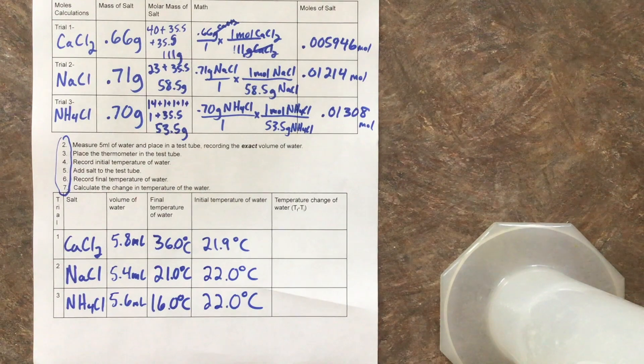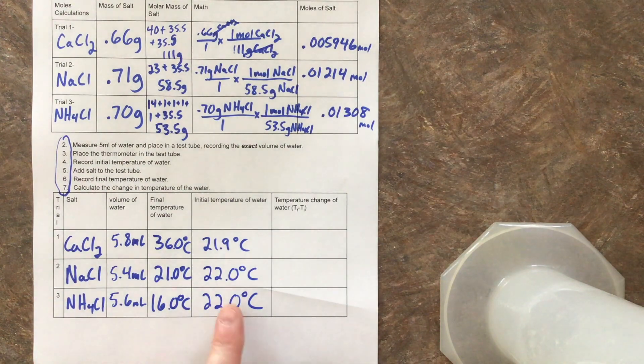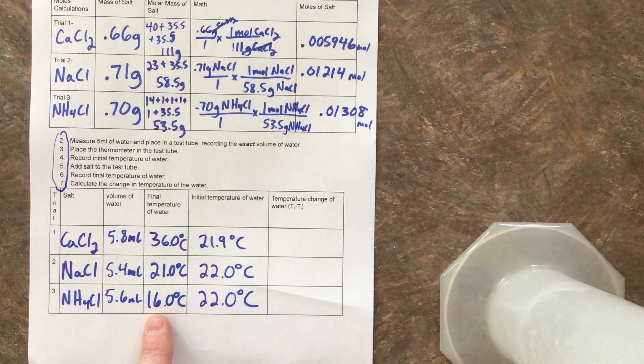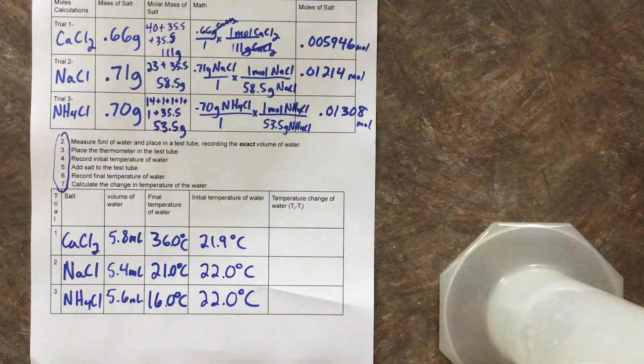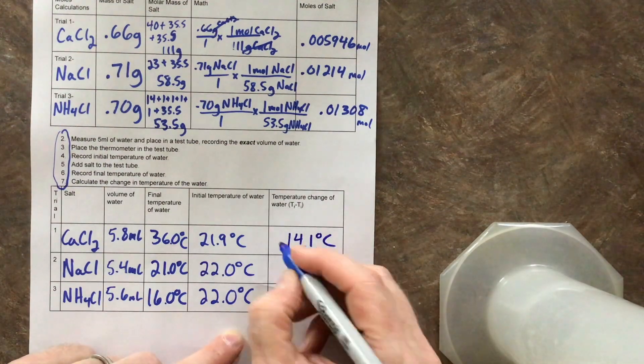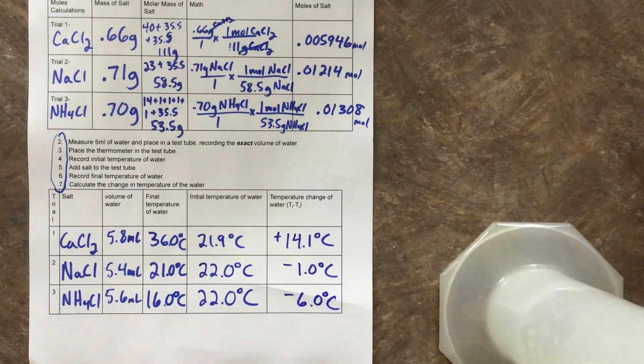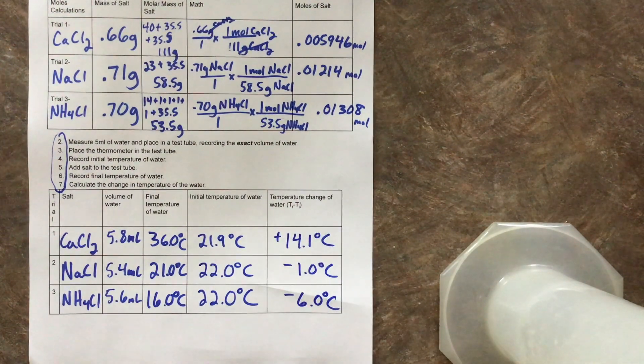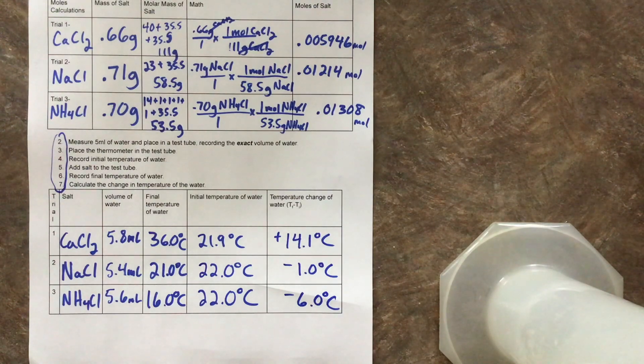So here's what we have for our data. We can see our temperatures are set up there. Our initial temperatures here. We have our final temperatures here. They all behave differently. So let's go ahead and subtract those numbers and find out what our temperature changes are. And you'll note, I did put positives and negatives. You do want to keep track. Was the temperature going up or was the temperature going down?